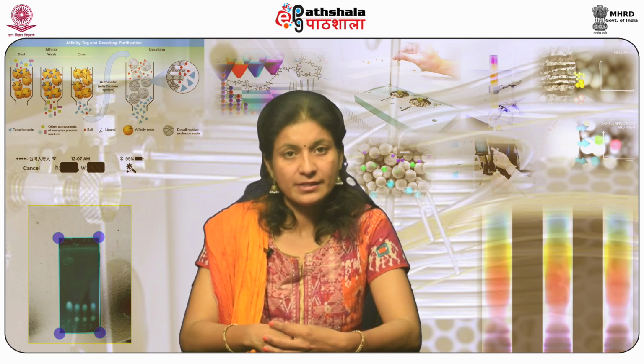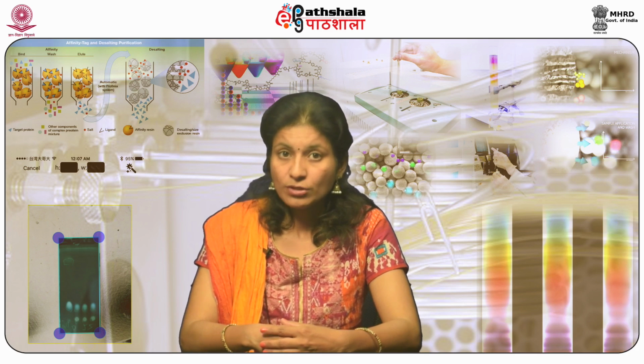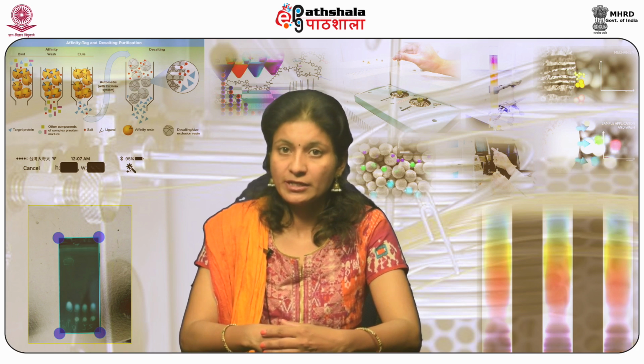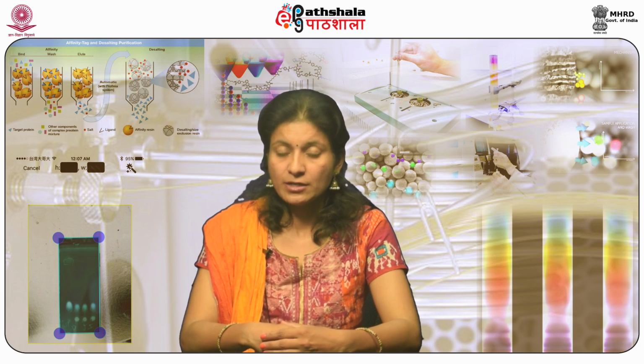Characteristics of analyte. To be suitable for separation by this technique, the compound should have thermal stability, that is, in general substances that vaporize below 300 degrees Celsius, should be highly volatile and have low molecular weights. The samples are also required to be salt-free, that is, they should not contain ions.